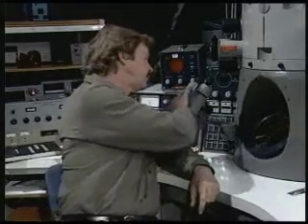Well, one way in which cells do this is by subdividing their cytoplasm into compartments called organelles. Now, some organelles are surrounded by membranes and others are not. Likewise, some are visible at the level of the light microscope and some are not. Now, you all will be using light microscopes in your study of microscopic anatomy, so what we're going to do in today's program is take you sort of on a journey through the cell with the light microscope, showing you the components that you can see and what they look like. So, let's go to the microscope.